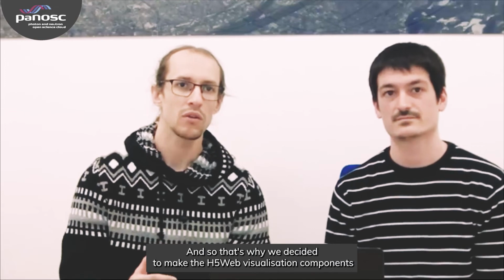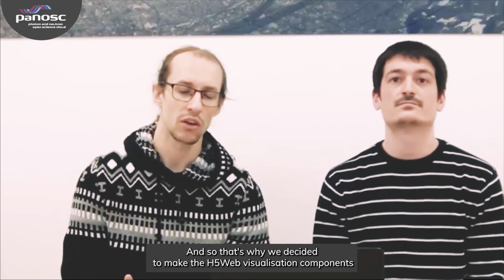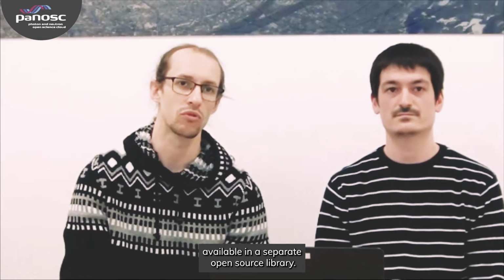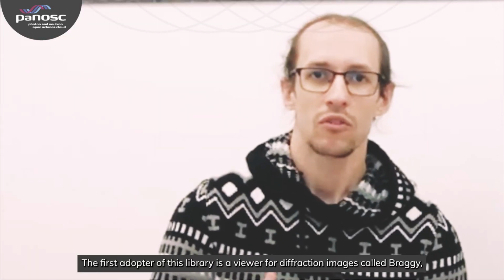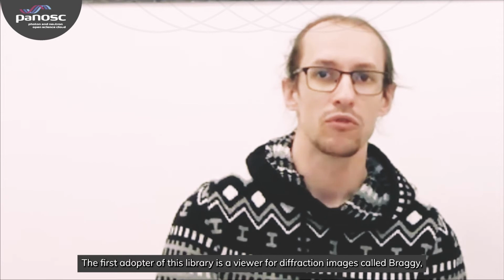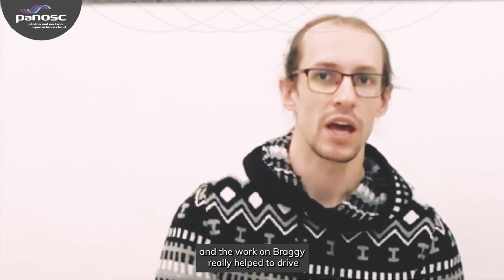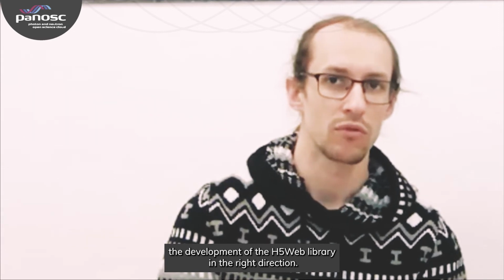And so that's why we decided to make H5Web's visualization component available in a separate open source library. The first adopter of this library is a viewer for diffraction images called Braggy, and the work on Braggy really helped to drive the development of H5Web's library in the right direction.